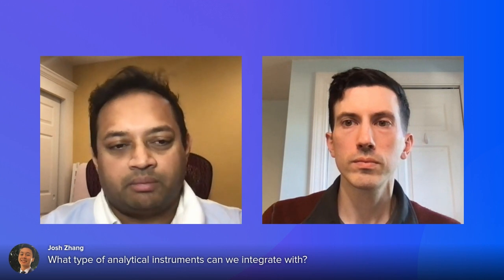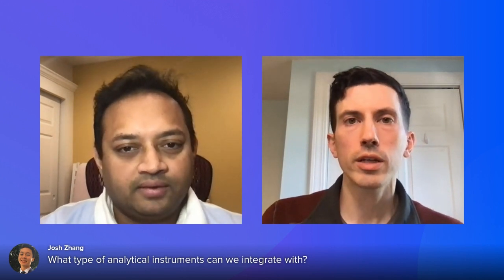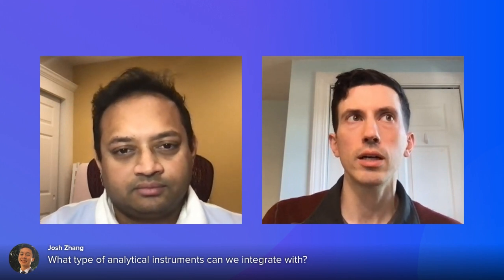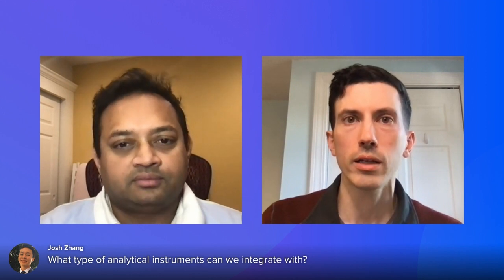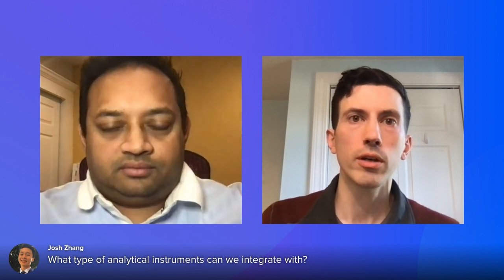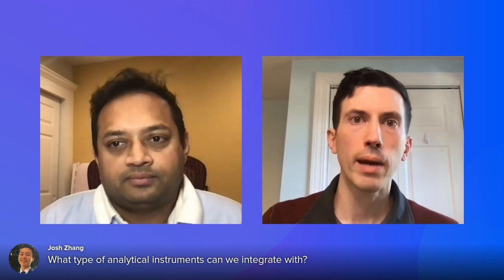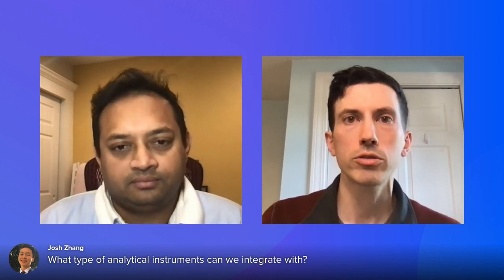So maybe Tom, if you want to add anything there. No, yeah, that's exactly right. Integration is a question that means different things to different people, and we can support the complete range, whether it's just data mapping or all the way through full programmatic data capture, a much more hands-off type of approach.